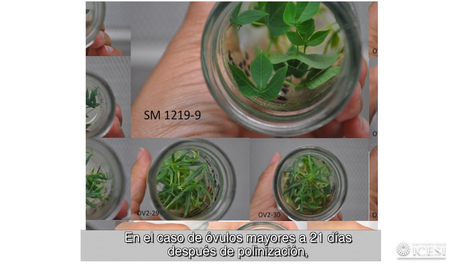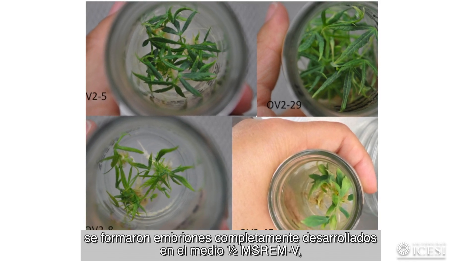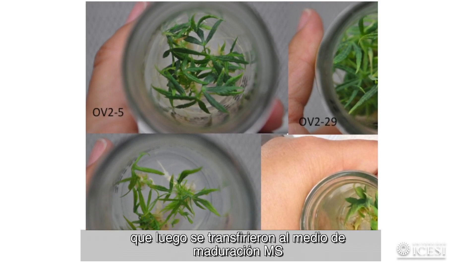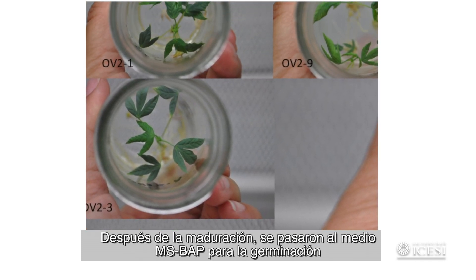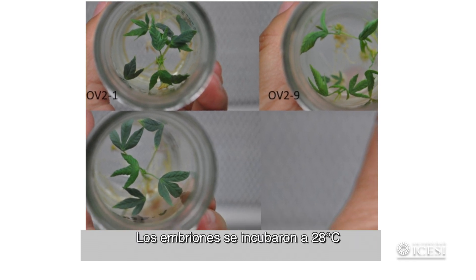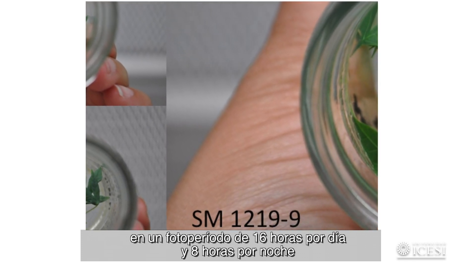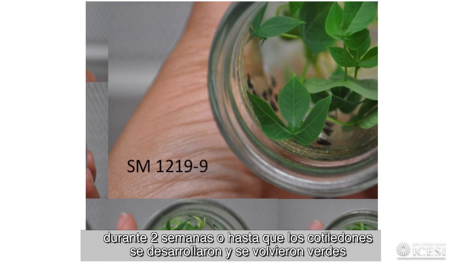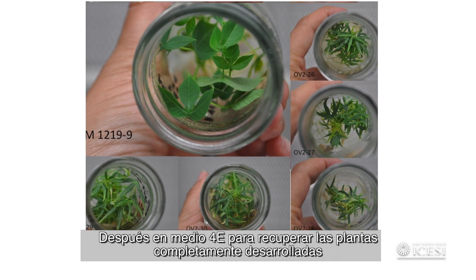In the case of ovules older than 21 days after pollination, fully developed embryos were formed on half-strength MS REMV medium, then transferred to MS maturation medium. After maturation, embryos were placed onto MS BAP medium for germination, incubated at 28 degrees Celsius in a 16-hour light and 8-hour dark photoperiod for two weeks, or until cotyledons were developed and turned green, then transferred to 4E medium to recover fully developed plants.